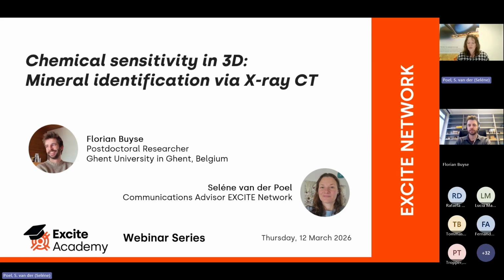In particular, he works on micro-CT techniques that introduce chemical sensitivity into laboratory imaging, enabling improved mineral identification in 3 dimensions without destroying the sample. Today, Florian will present recent advances in both standard and spectral micro-CT and show how these can enhance non-destructive mineral discrimination in complex geological materials. So please, Florian, take it away.